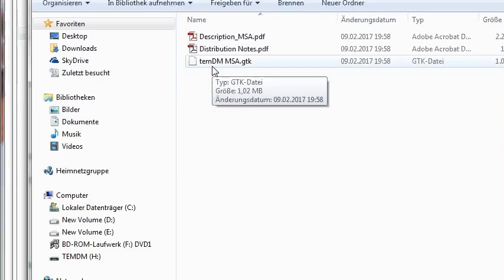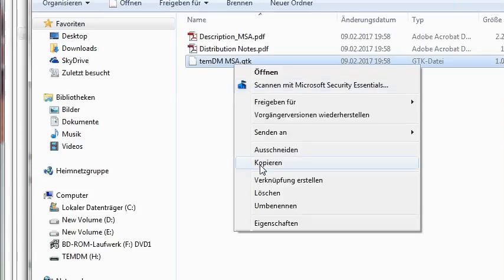The code itself is inside this file. It's called TEMDM MSA.GTK. And installation is very simple. Just copy this file.